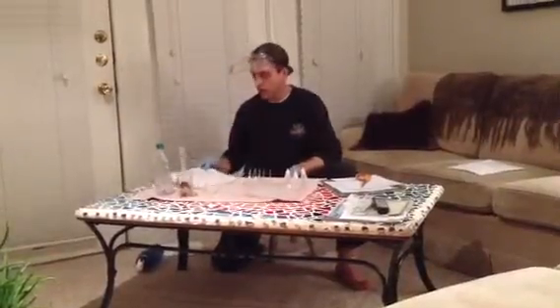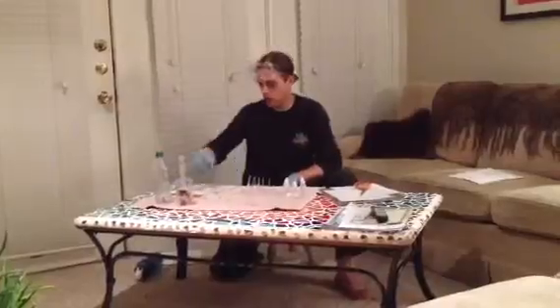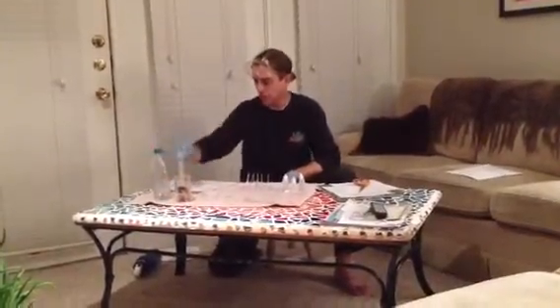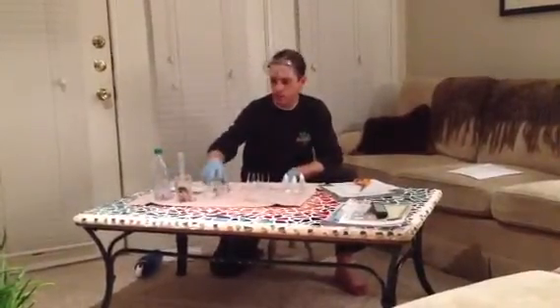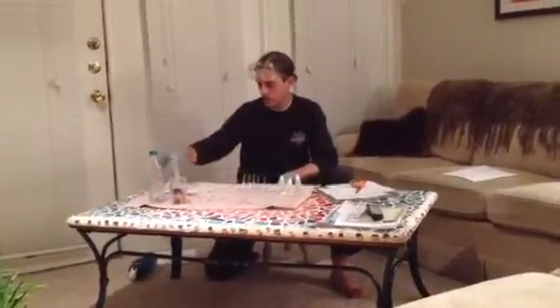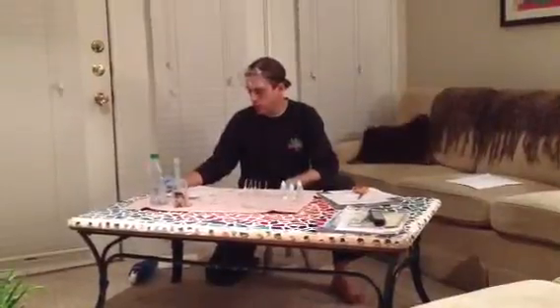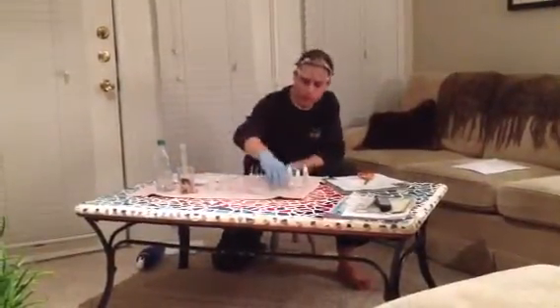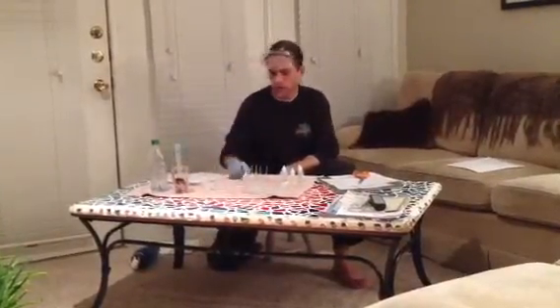For this experiment, I've gathered all my materials. I've got some household bleach in this container here, distilled water, toothpicks. I've retrieved my 2 plastic beakers, my graduated cylinder, a pencil for marking. I've also got my glass test tubes right here, and a 24 well plate.